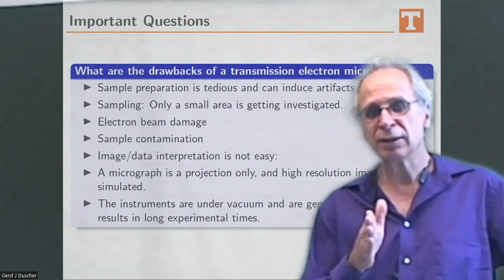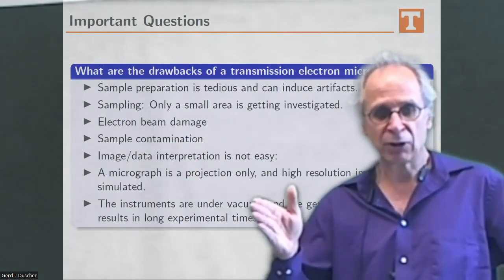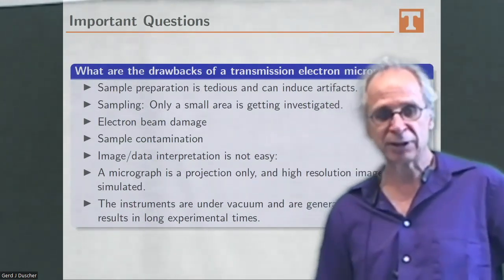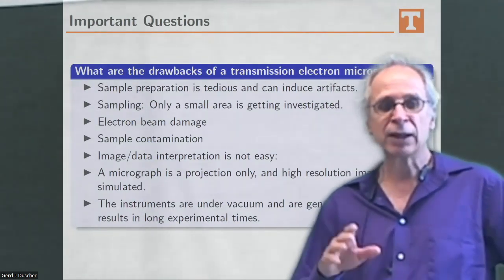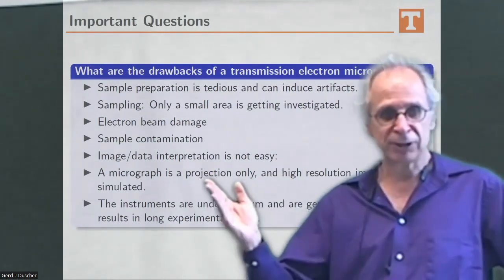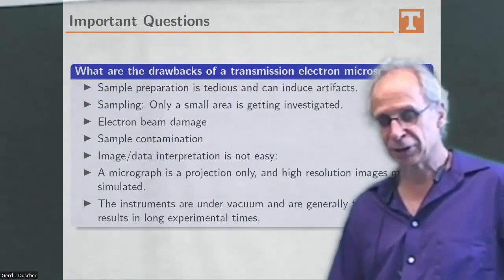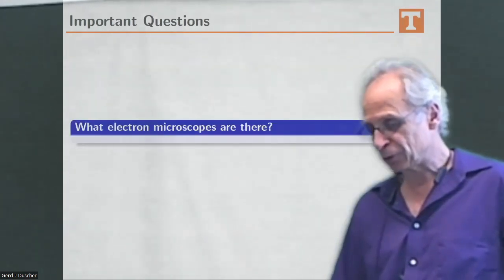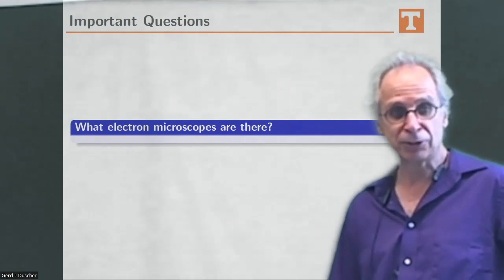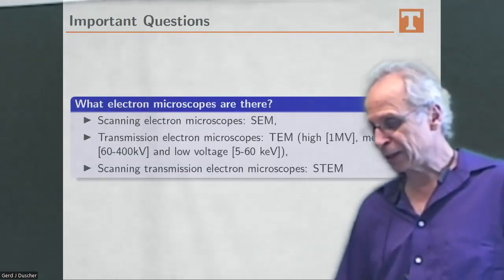So the key, in my opinion, is to set up your experiments so that it matches your questions. And so that's where the expertise in the future will lie. And machine learning can actually help with that, because if you just always get all information and sort it out later, that is, of course, beneficial, but you don't necessarily always make a good choice the first time you look at a sample. We talked about that already.